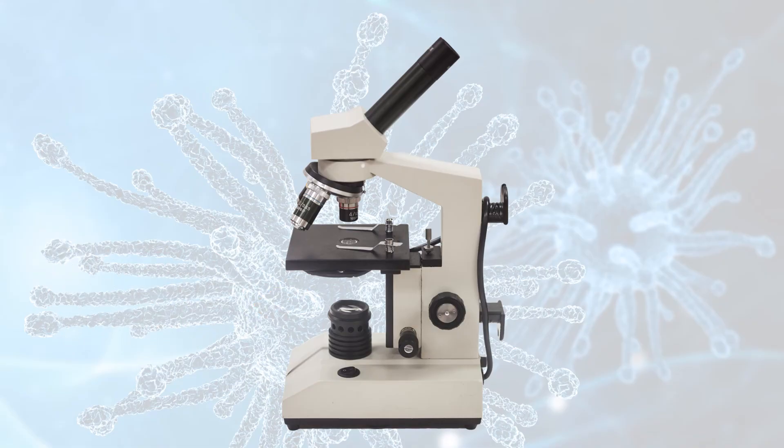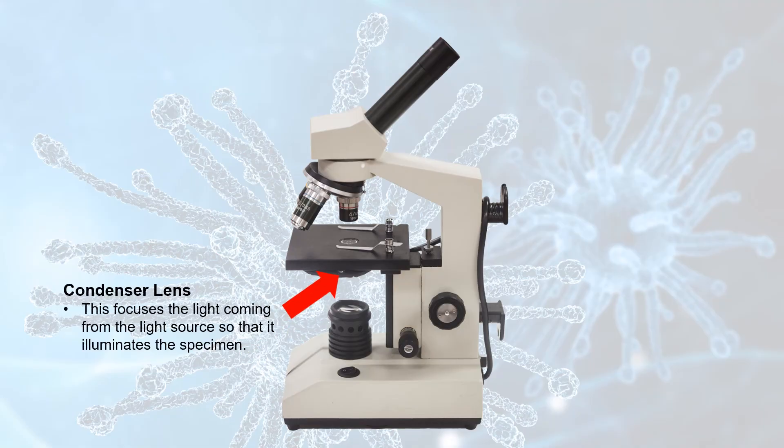Also underneath the stage, you have the condenser lens. This lens focuses the light coming from the light source so that it illuminates or lights up the specimen.